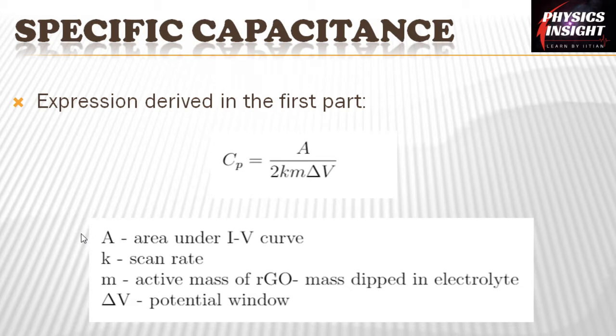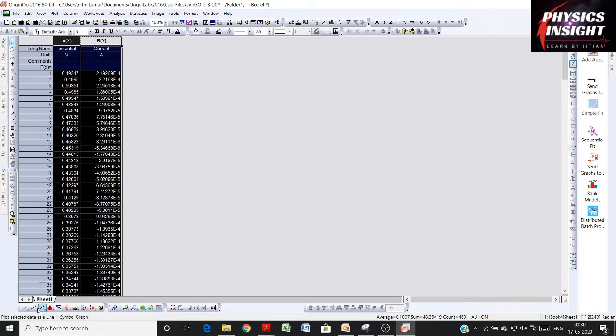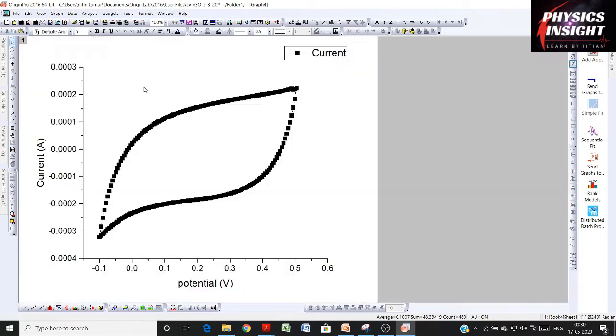So let's start. This is CV data that I have got from performing an experiment. Let's analyze this data by plotting the CV curve. The curve looks something like this.